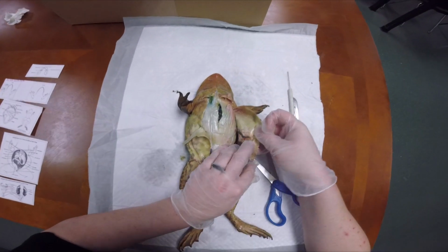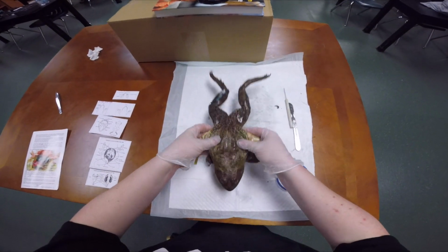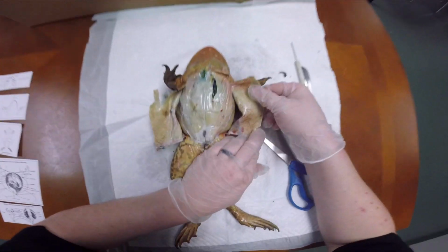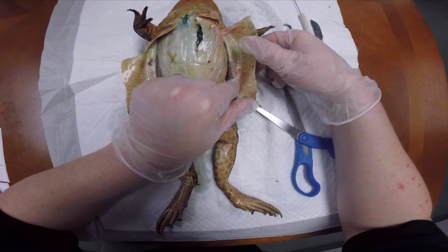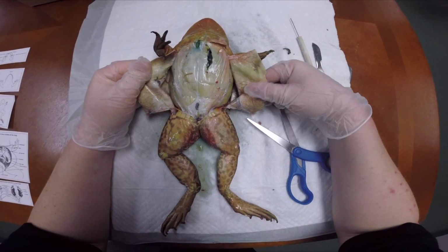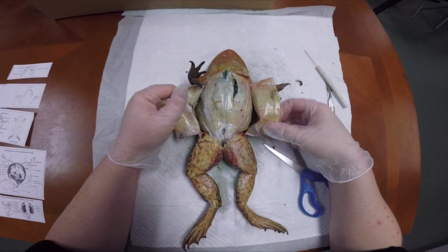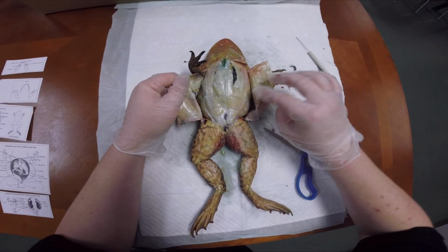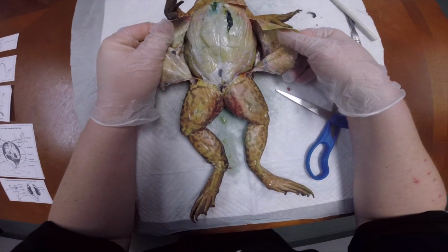Okay, so now we can peel this back and just get some of the liquid out here. All right, so that dye that you remember, the red dye, helps us to see the blood vessels in the skin. So when you peel back your vest, you'll be able to see those blood vessels better due to that dye that they have injected for us. That dye just kind of gets everywhere, so you gotta be real careful. So those are the blood vessels. You can see there are a lot of them on either side.